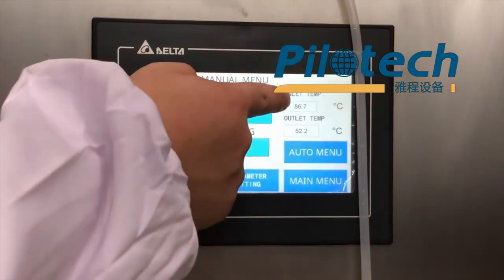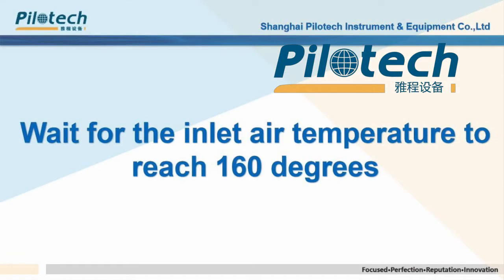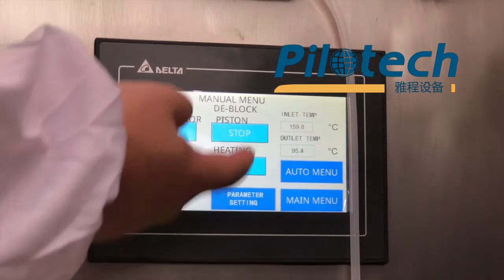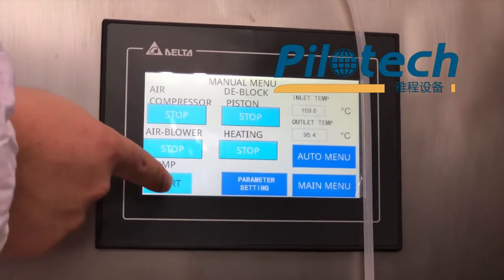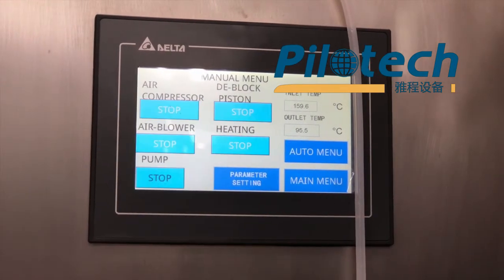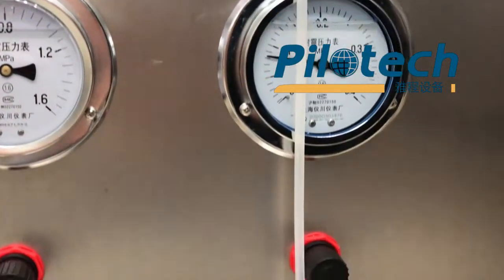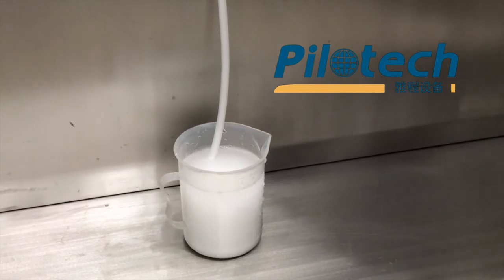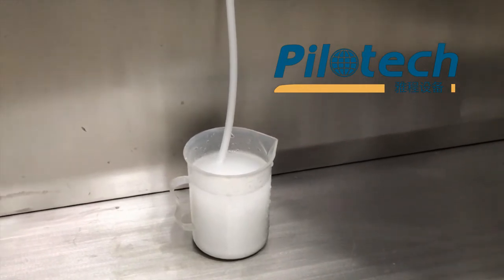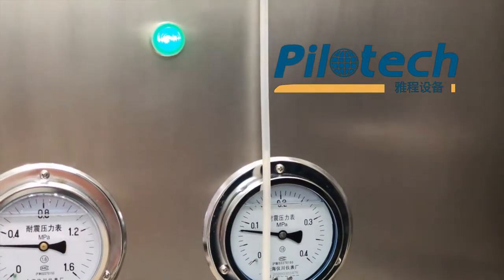We need to wait for the inlet temperature to reach 160 degrees, then we can start the pump. Now the inlet temperature is near 160 degrees, so we can start the pump now. The material is being delivered through the feed tube by the peristaltic pump.